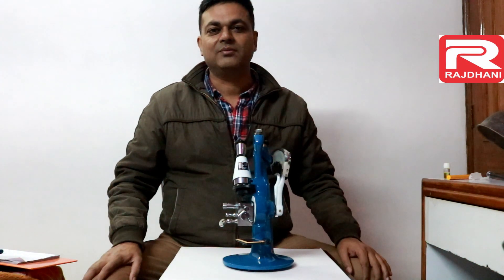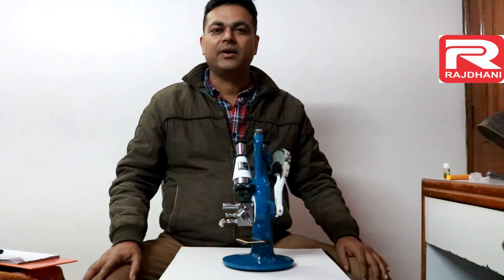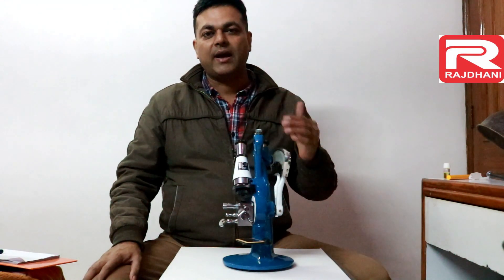Hi, I am Sudhir Tyagi from Rajdhani Scientific Instruments Company, Delhi. Today I am going to tell you about the Abbe Refractometer.